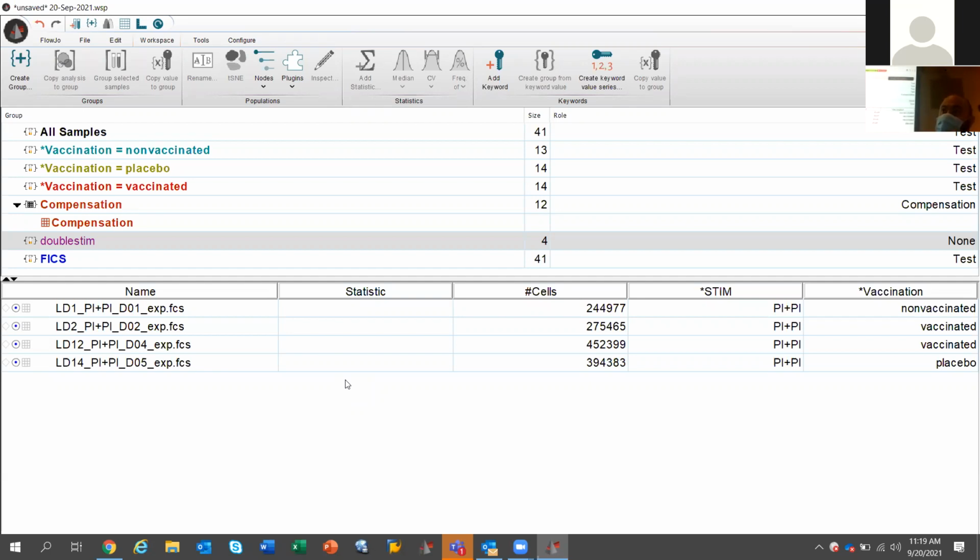They're only appropriate if your antibody was self-conjugated, so if you conjugate it in your own lab. But if they're validated by a manufacturer, you don't need an isotype. Then you use your FMOs to set your gates. Okay? All right, moving on.